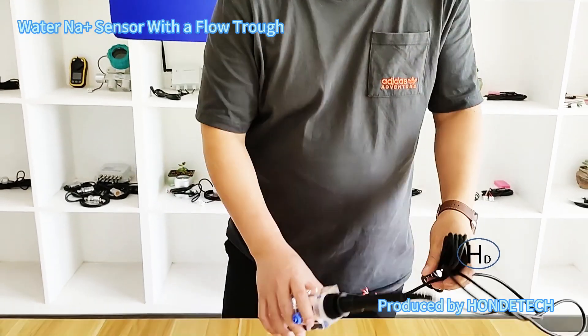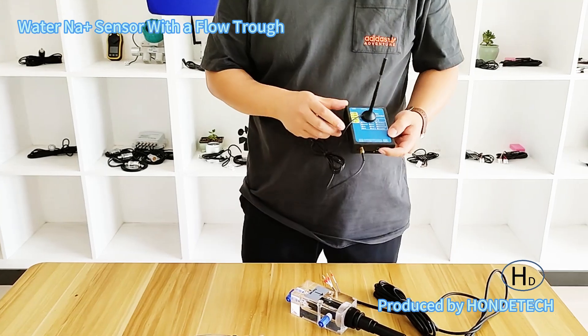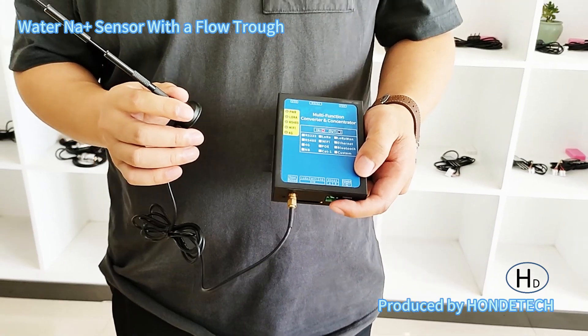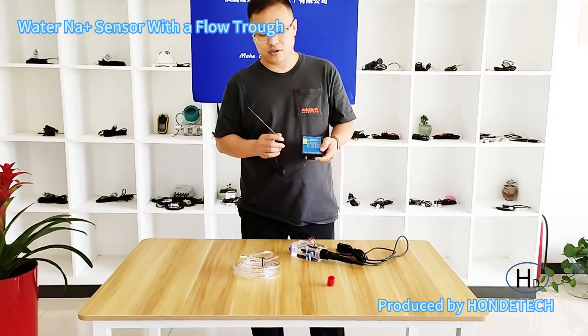We can also provide a wireless module with GPS 4G, Wi-Fi, and also a cloud server and software if you need, to see the real-time data on your PC and on your mobile device.